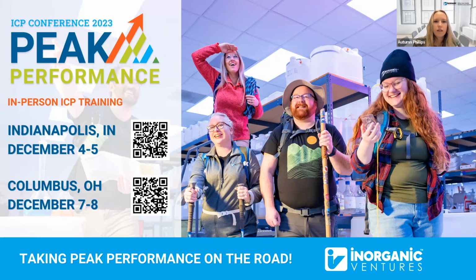All right. And this is somewhat similar: what is the best method to check the health of a spray chamber that is not glass and cannot be looked through to check for droplet formation? Well, get a transparent spray chamber, that's the best way. But seriously, there are some transparent PFA spray chambers on the marketplace. If you don't want to swap, the only way is to take it apart, because these Teflon spray chambers are demountable. You can take it apart and look at whether you see bead formation or not.